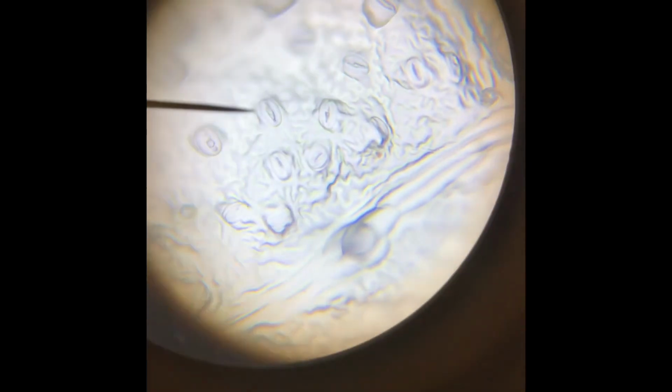This is Lantana. You'll need to push pause on the video so that you can make your drawing. I have the pointer on one stomata. I'm sorry this is moving around. If you're motion sick, you need to push pause. Hang on, one sec. Oh, come on, there you go. All right, there you go. That should allow you to make a drawing of the stomata. Just like I said, push pause so that you can get it steady in motion. Ugh. There we go.